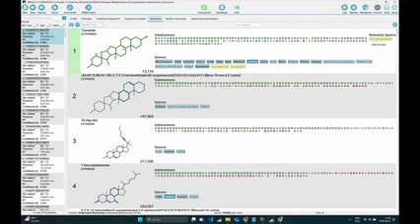So if we repeat this with a second hit, we will see that here it doesn't look as good. We can see this part seems to fit quite well, and this part doesn't fit, and the middle one, yeah, we don't really know. Okay, so this is a quick overview. Markus also explained a few other things of this.